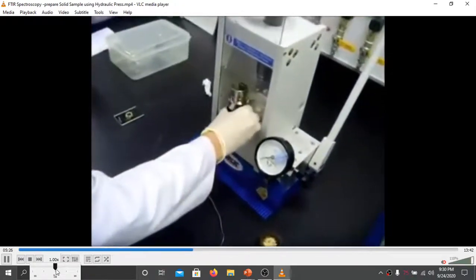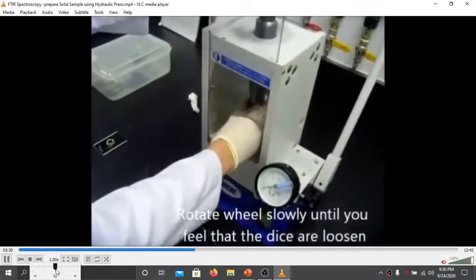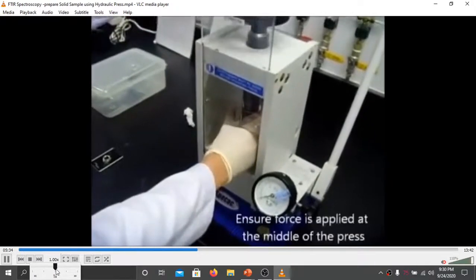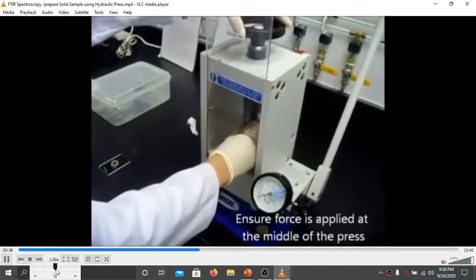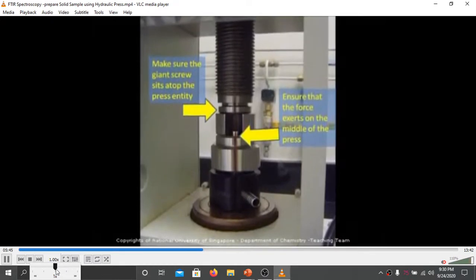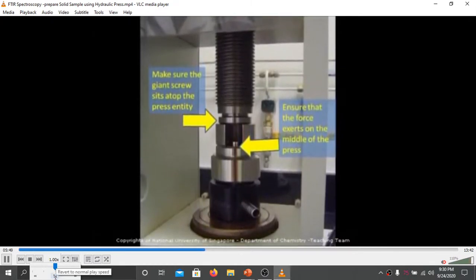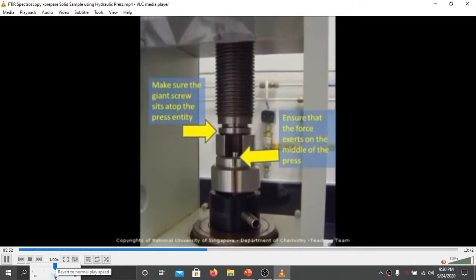Care should be taken that the pellet does not get broken while you are applying pressure. The rotation wheel is turned slowly so that the bolt will push out the pellets. Ensure that the force exerted in the middle of the press does not cause any breakage of your KBr disc.